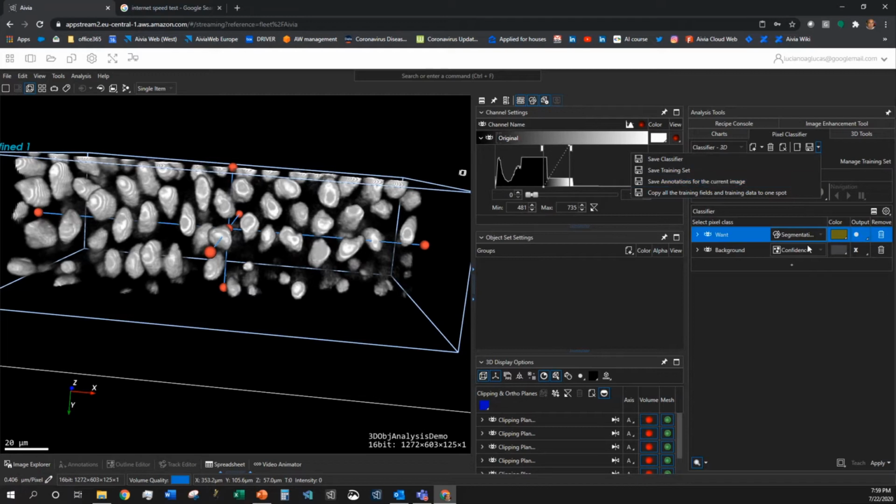Do you mind going through the different options in saving? Yeah, sure. This is always a nightmare. I always save all four because I never know which one is actually going to contain both the data and the recipe. Well, this is the best one, copy everything. So if you use the bottom one, it's kind of like from least amount of stuff saved all the way to the most amount of stuff saved.